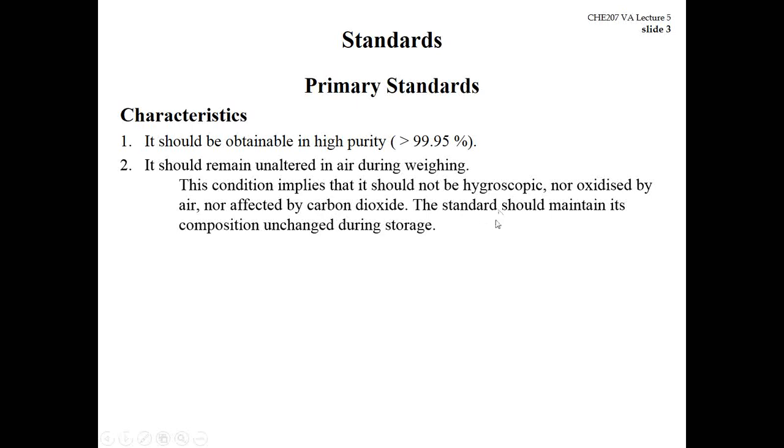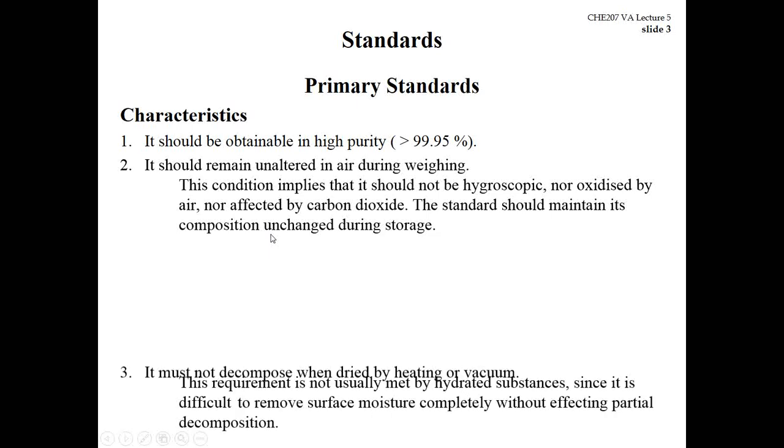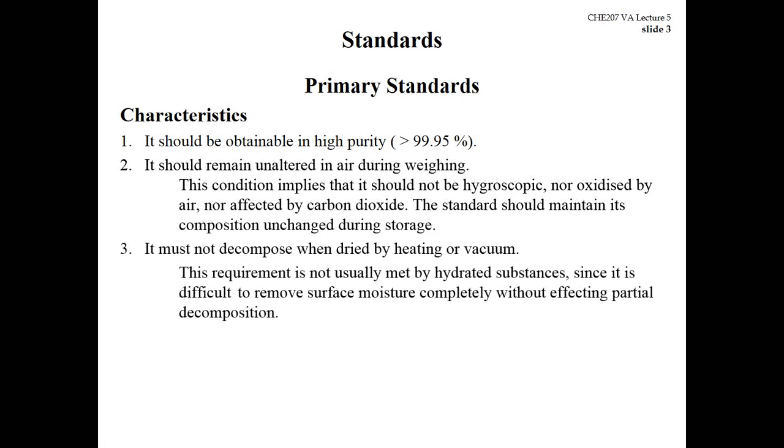And the standard should maintain its composition unchanged during storage. Very often we keep chemicals in the lab for a period of time.